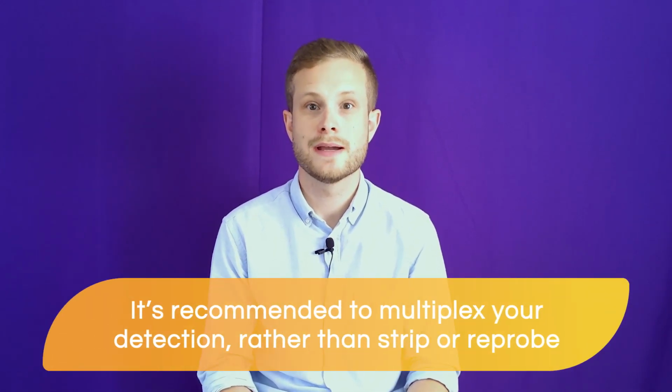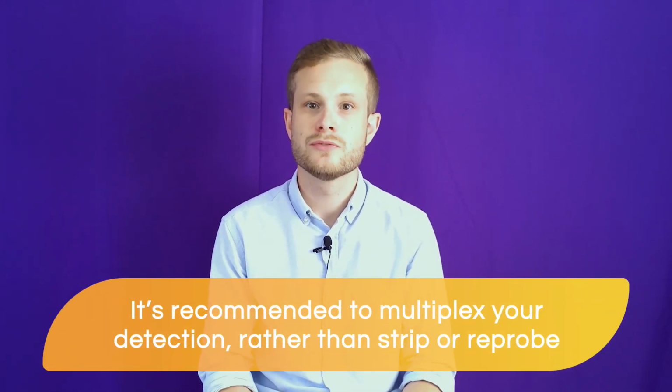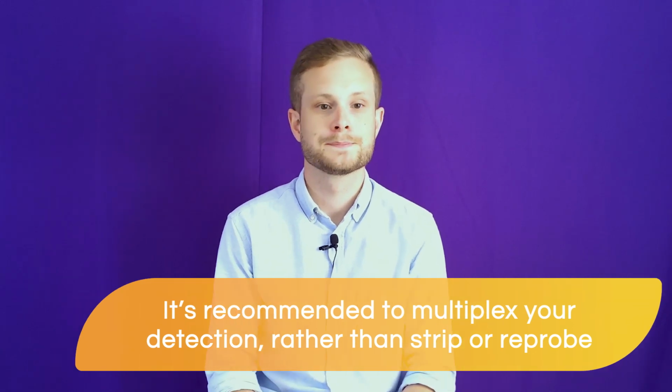Ultimately, for the most accurate quantitative results, it's instead recommended to multiplex your detection, to avoid the need to strip and reprobe altogether. As this is easy to perform using near-infrared detection with multiple channels, you should rarely need to strip and reprobe the membrane anyway.